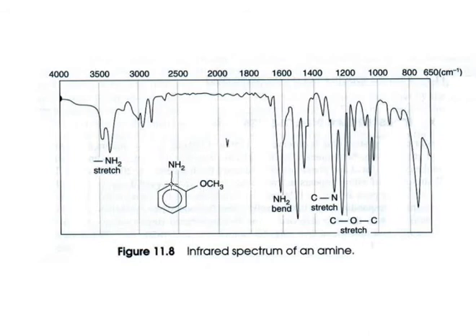All right. Now the aromatic ring, let's take a look at it. The CH stretches of the aromatic ring, we should see something above 3,000, and well, there it is. The peak is kind of squished a little bit, but that peak right there extends over 3,000, and indeed that's going to be caused by the aromatic CH stretches. Now we should see a band at 1500 and 1600 for the aromatic ring. Now that's probably the shoulder of this bigger peak. This NH2 is actually identified as a band, but you can notice it has a little shoulder here right at 1600, and that undoubtedly is due to the CC stretch of the benzene ring.